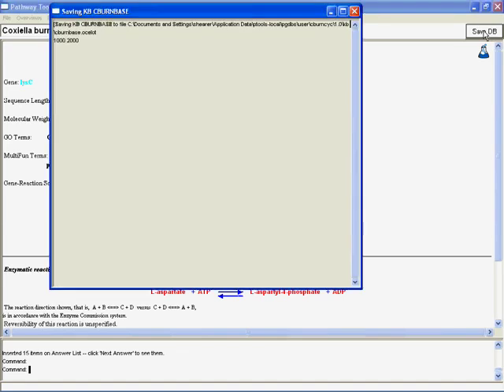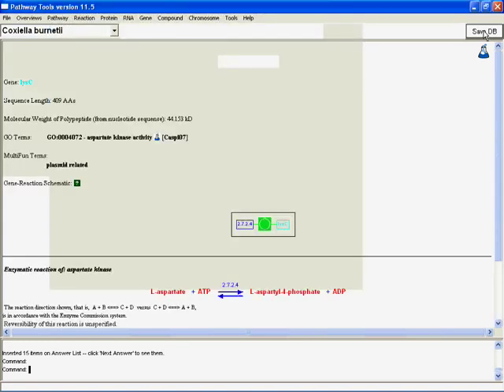So to save, we have it easily up here. We just click Save DB, and it would tell us that it's saving. And that's it walking through the database and saving our current changes to it. And now we're saved. Okay. And you can save very frequently. You can't save while you're in one of the editors. That's important to remember. So I recommend, just on the off chance that something bad happens, not doing a whole ton of unsaved work all at one time in the editor. I'm happy to click out of the editor, save, open the editor again, keep working.